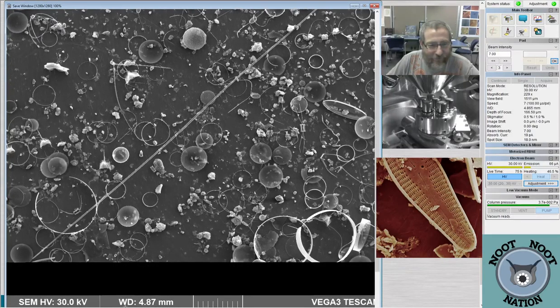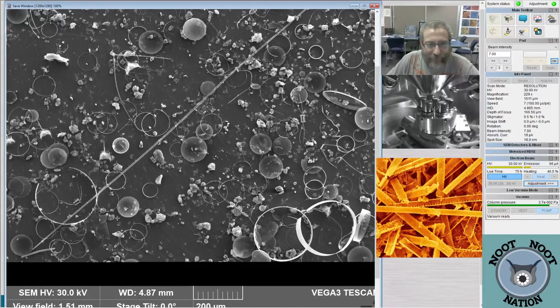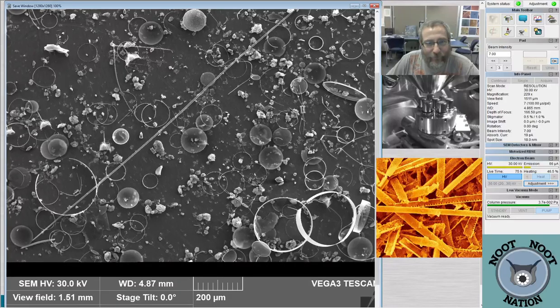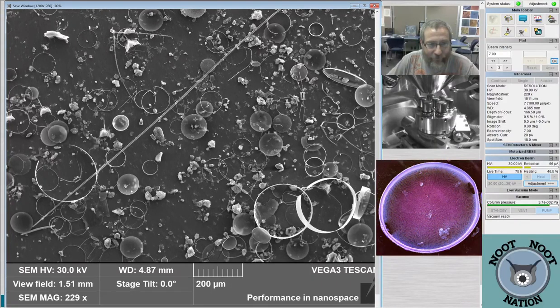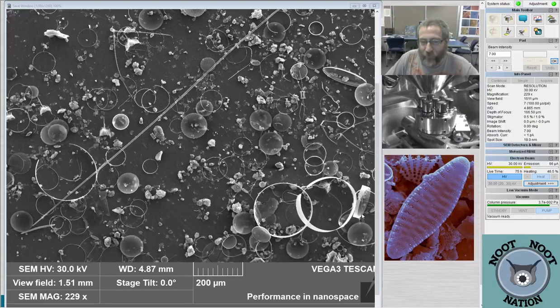Jack F93 just arrived and wants to know, what are those many circles? Those are diatoms. We're looking at plankton from San Francisco Bay, and the little round things that have solid material inside of them are diatoms. And the ones that are just little rings without anything in them, like this one over here, are actually a girdle band for one of the round things. So they're just a piece of it that fell off.